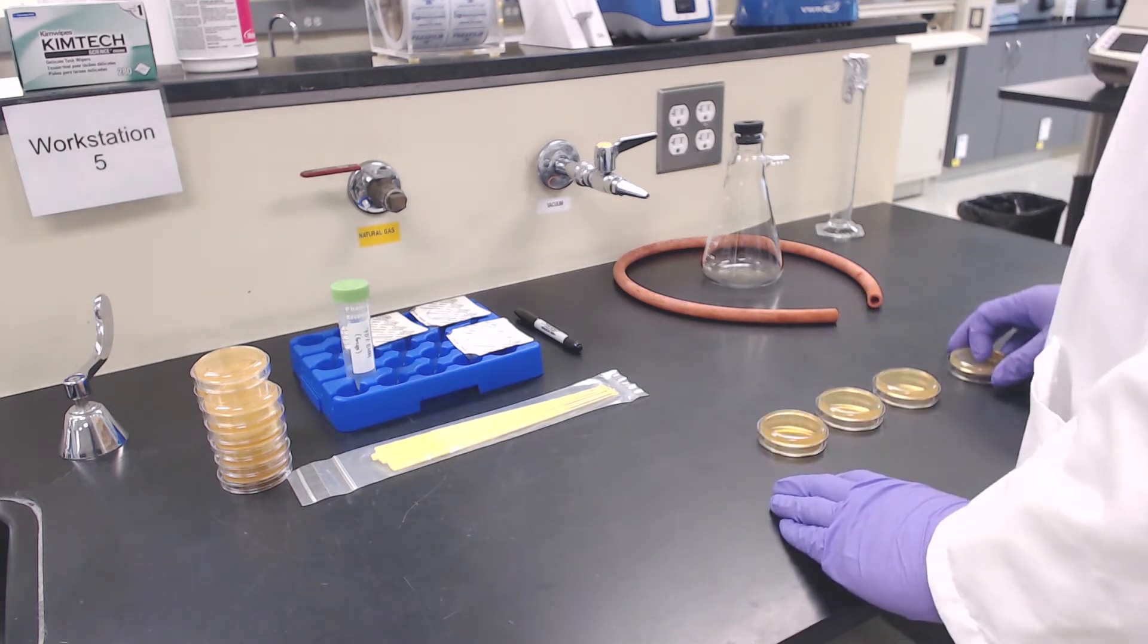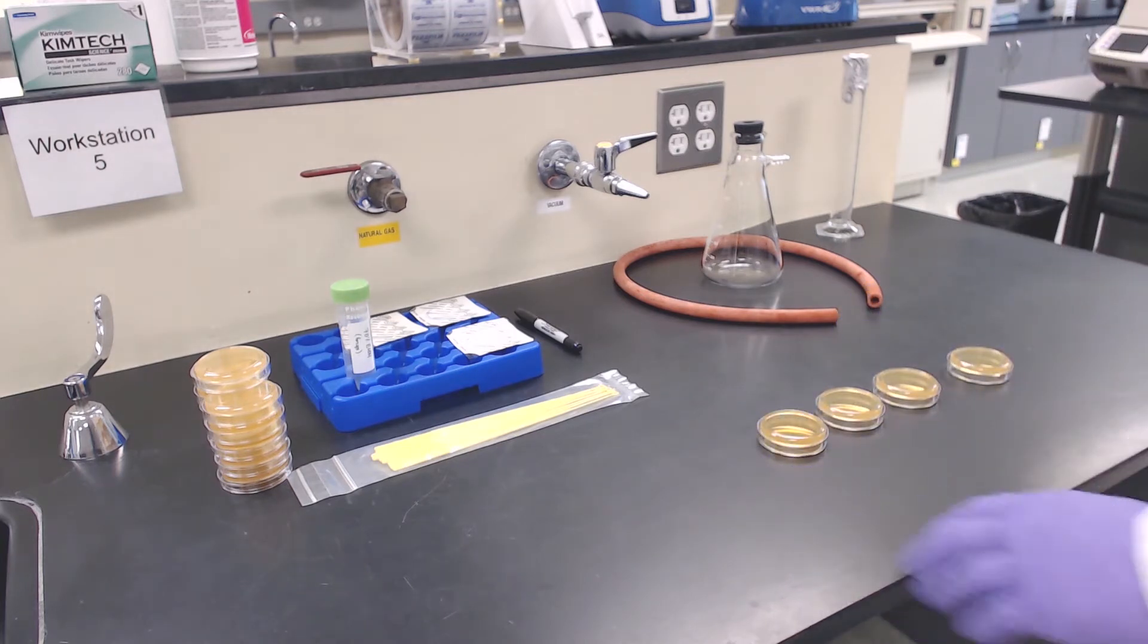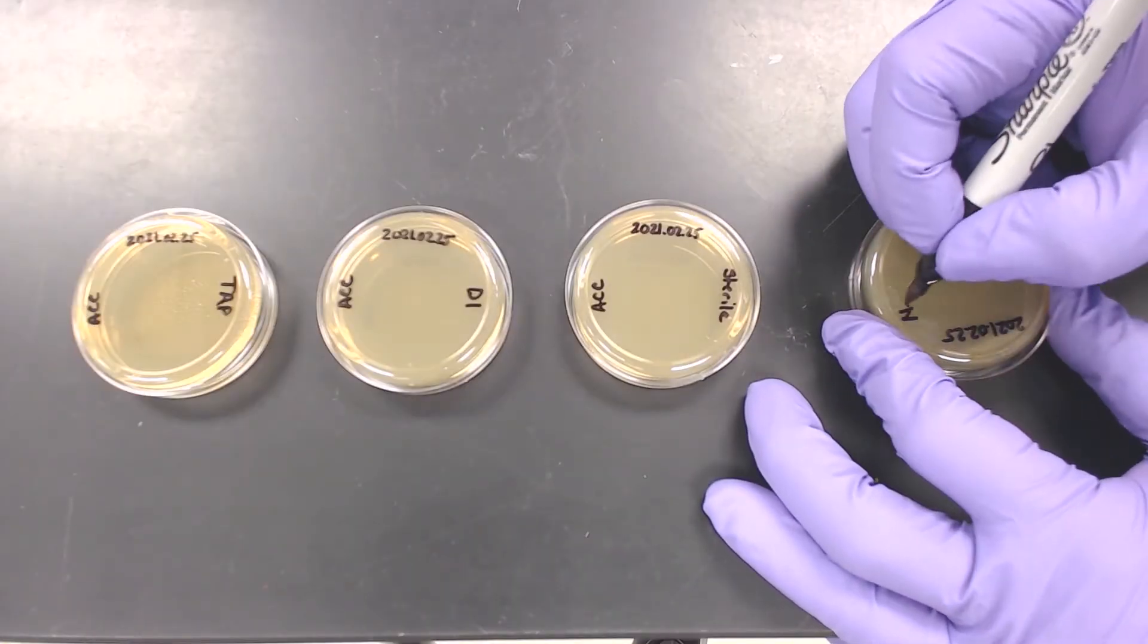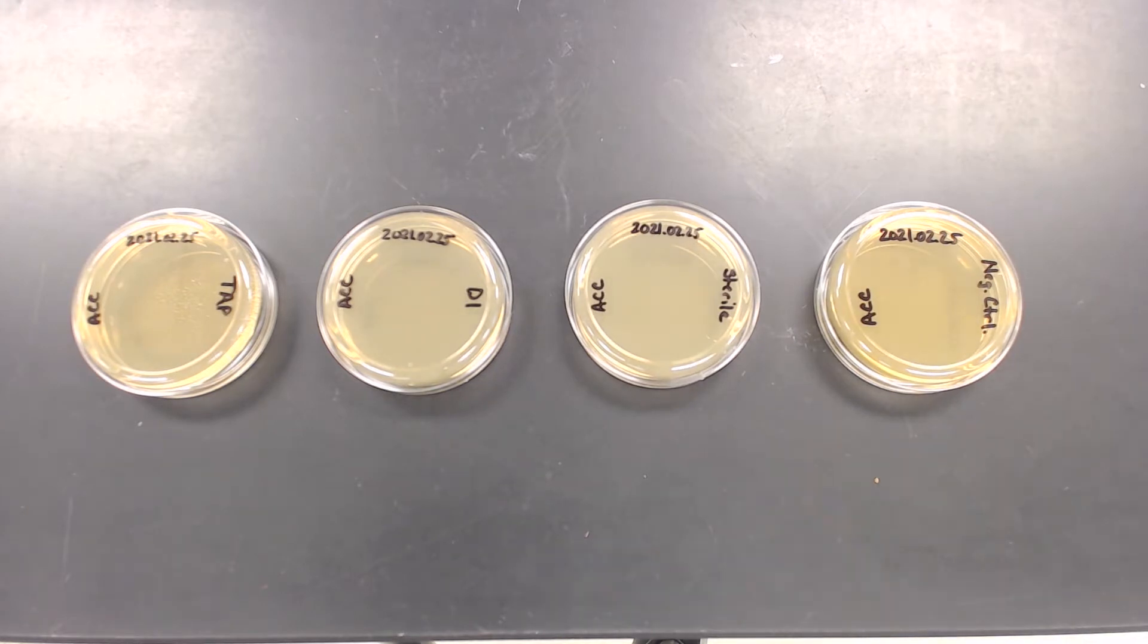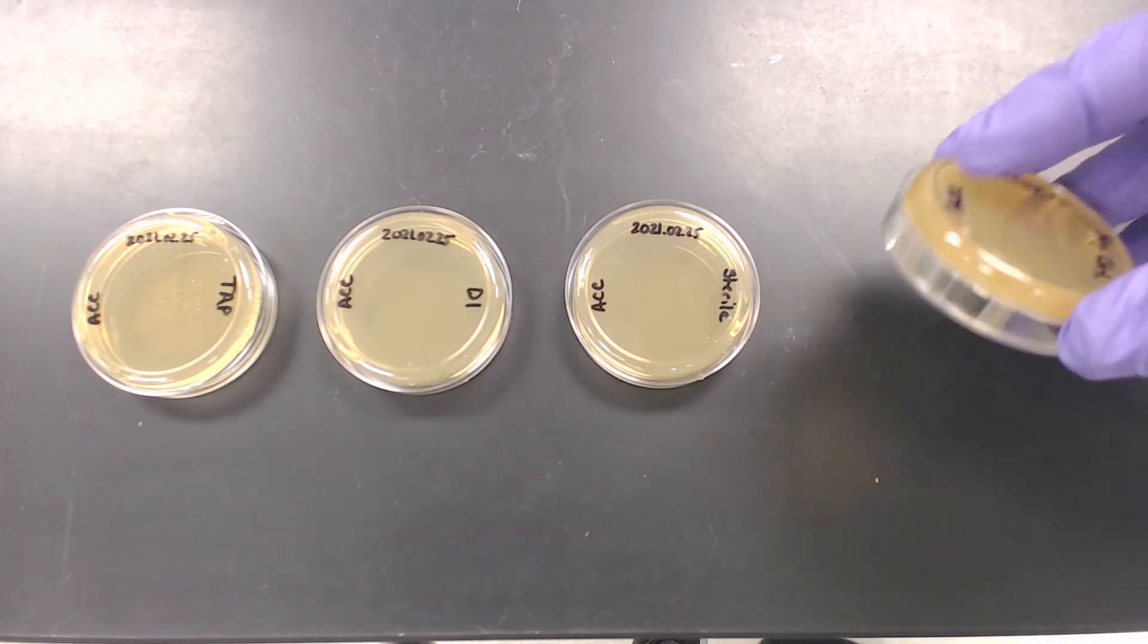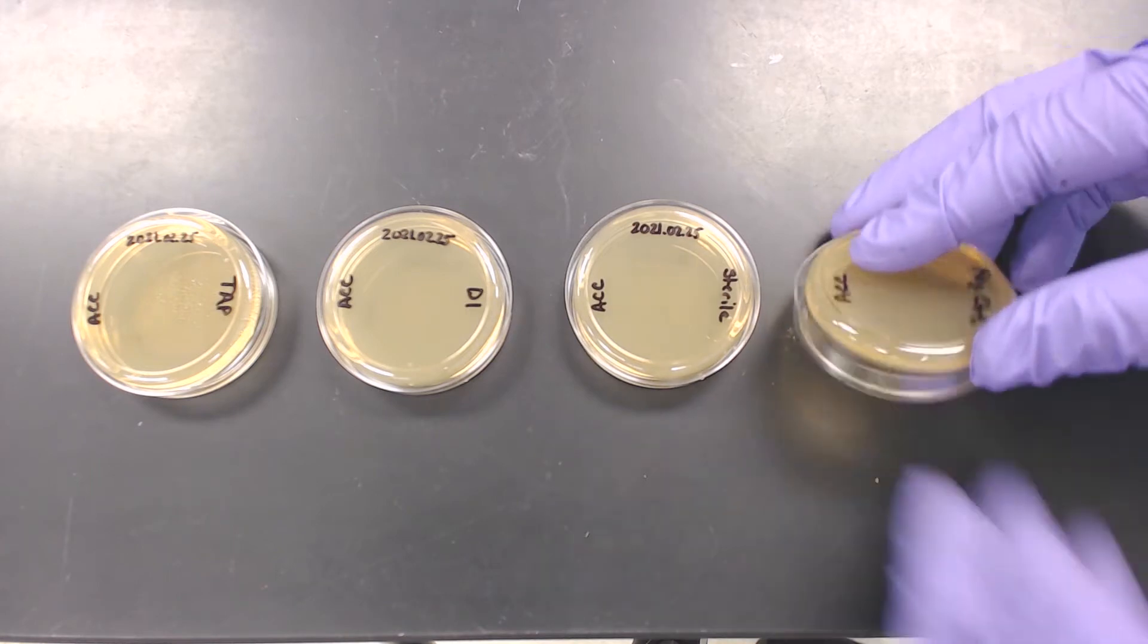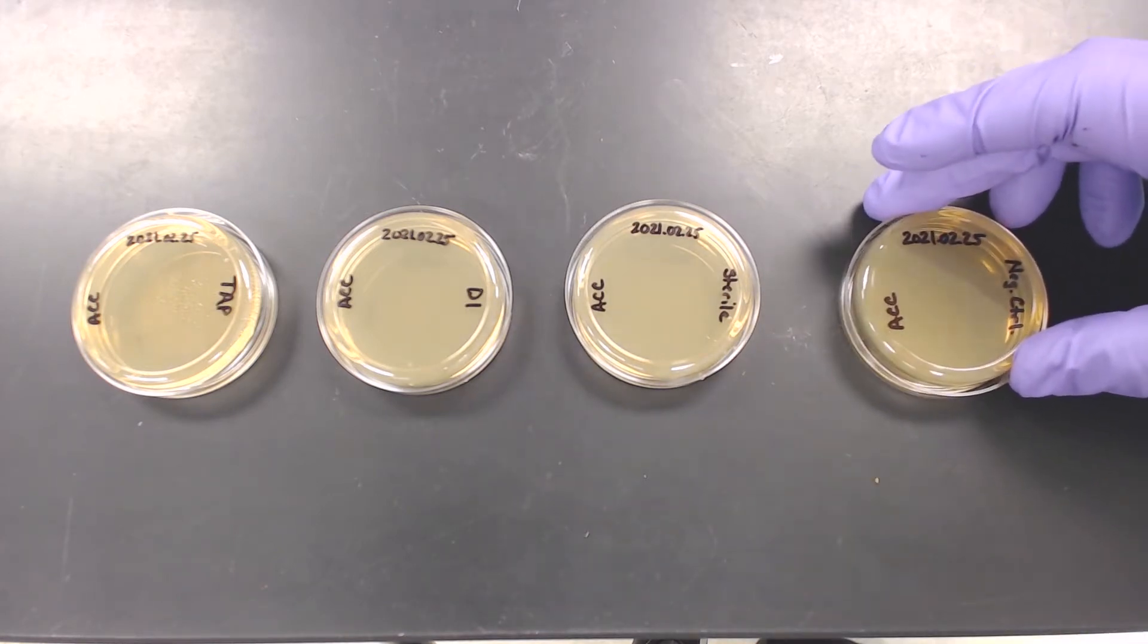Part 1: Begin by obtaining 4 plates, one for each of the 3 water samples and the 4th plate for a control. Label the plate with your initials, the date, and corresponding sample name. Ensure the label is made on the half of the petri dish containing the agar. Do not label the lid, as it could become separated from its agar plate.